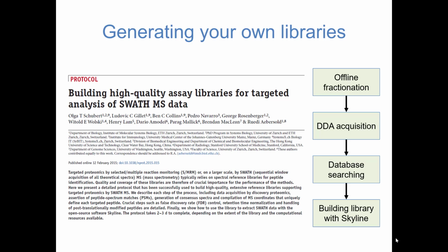You showed this paper. When we try to run that protocol, SpectraST crashes on us. It has trouble with the iProphet output from two search engines. Is that something we can try to figure out here? Oh man, I don't want to. Well, you showed the paper. Yeah, it's not my paper though. It's your slide.